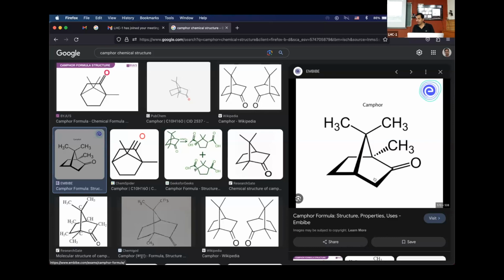Why is this important? Although this is a methylene group, each proton will behave differently. It will couple with itself. These are geminal couplings, meaning that these are 2-bond proton-proton couplings. We are comfortable talking about 3-bond proton-proton couplings, but this also has 2-bond couplings. So here life starts to get a little complicated because the chemical shifts of the 2 protons will be close, where the scalar couplings will start to play a role and give strong coupling effects. We will see some examples of this.